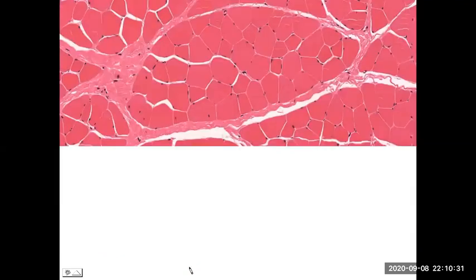And we're now going to look at a third example. The difference is now this is a cross section. The previous sample of skeletal muscle was a longitudinal section going along the length of the cell. In this case, these cells, you can imagine they're running out of the screen. They're cut across their width, or a cross section.